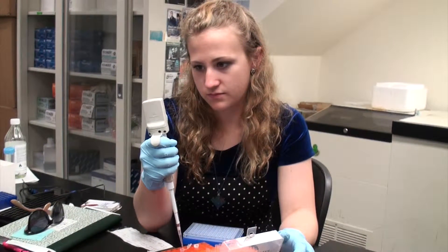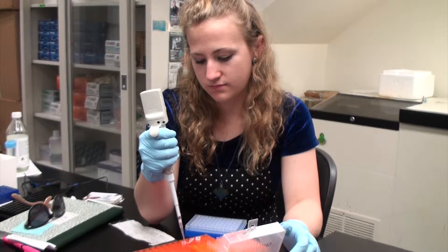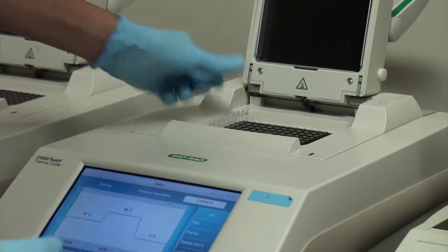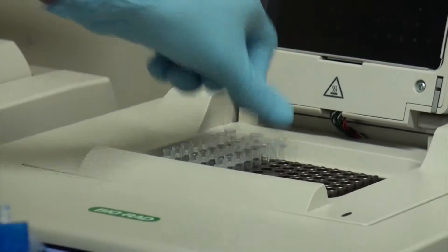We put our master mix into a 96-well plate along with our samples, so you have to enter each sample twice. Then we put it in the thermocycler on a program that we call 'three one auto.' That runs for about an hour and then we take it out.